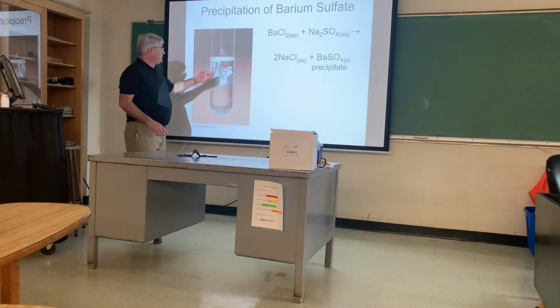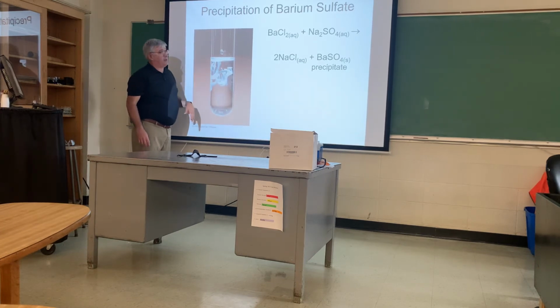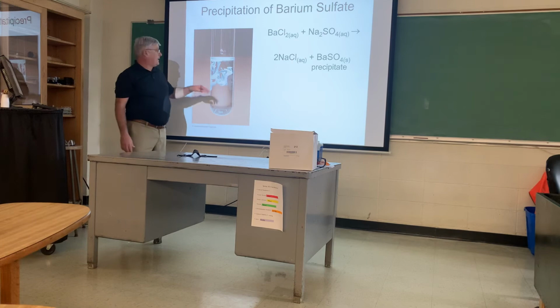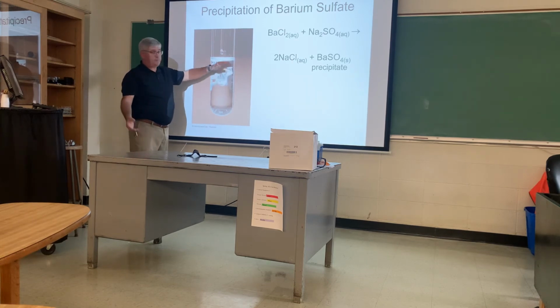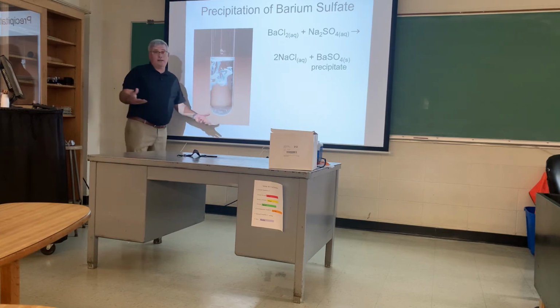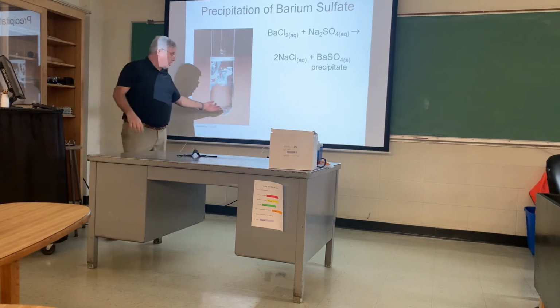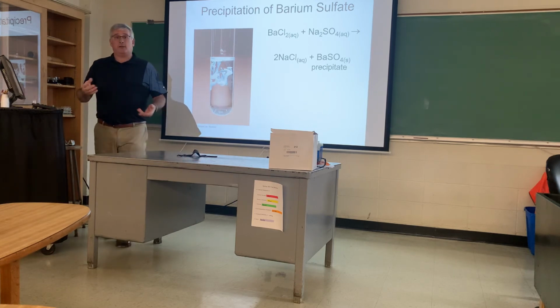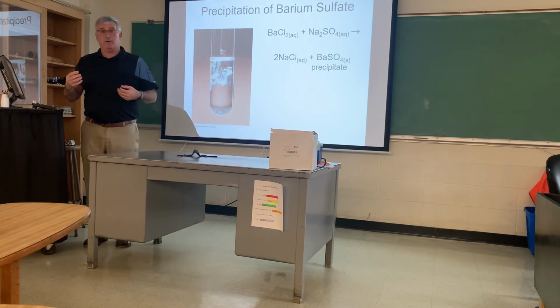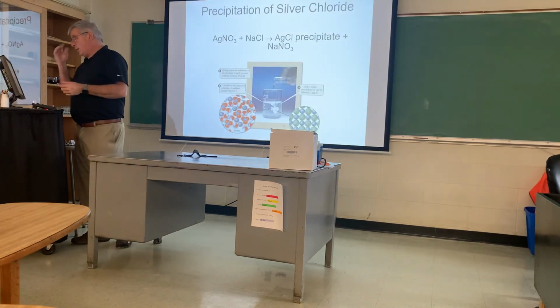Now, sometimes the precipitates are very dense and they will go to the bottom and your solution above that will be very clear. Or we can actually put that into a centrifuge and push the solids, which are more dense than the liquid, to the bottom, and then that allows us to decant, and we have the solution on top or we have the solid on bottom to do more chemistry, and that will be useful when you're working on the two cations.